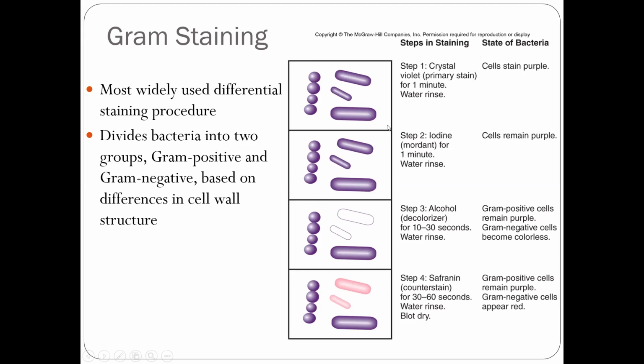It's a differential stain. And also we mentioned in the lab, as a gram stain, we need to record 3 important pieces of information, which is gram result, positive or negative. Second one is morphology, it's cocci or rods. Last one is arrangement. Is that single or a chain or grape shape? That's 3 important pieces of information for the gram stain.